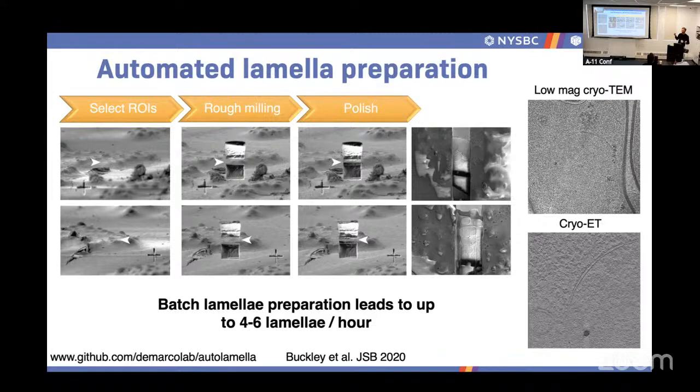Most of the time, because it takes so much time to prepare the samples, you're better off increasing the number of sites and lamellae that you're making, and then going back and taking the ones that are good. Optimize maybe your workflow, your protocol, so that you maximize the number of lamellas that work, but don't spend time doing too much stuff manually because it's not well-invested time. That being said, if you have a biopsy from a patient and you cannot have a second biopsy, maybe you will want to be a little bit more careful, but generally speaking, go for numbers rather than perfect lamellas.